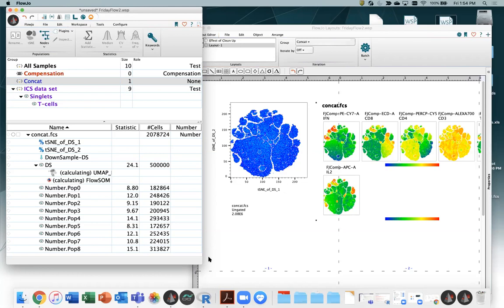The place where there's a lot of variety that will make a big difference is in the RAM. The RAM is your computer's easily accessible memory, the stuff that it can think about right now, as opposed to pushing to long-term storage. So again, more is more. The minimum requirements are highly dependent on your data set. There really is no minimum requirement. It'll always run. It'll just take much, much longer with less RAM.